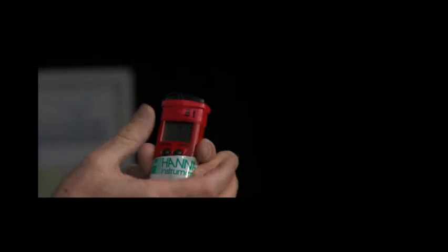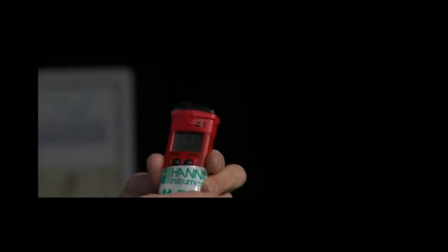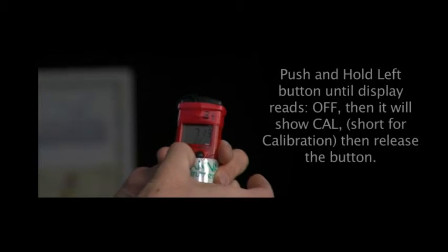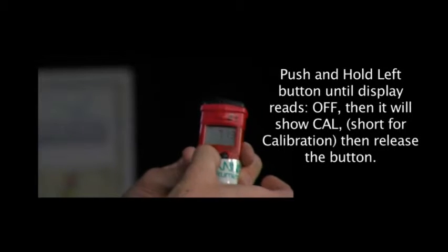When it displays the 4, you push the button again and it will say OK, which means OK, it's accepted the 7 calibration. So I'll just do that quickly here.